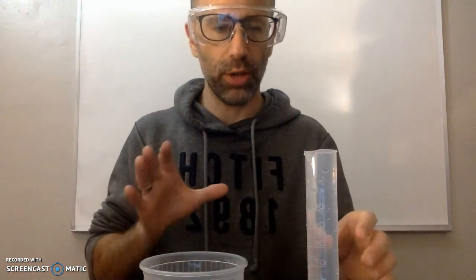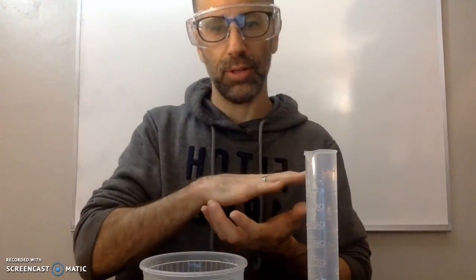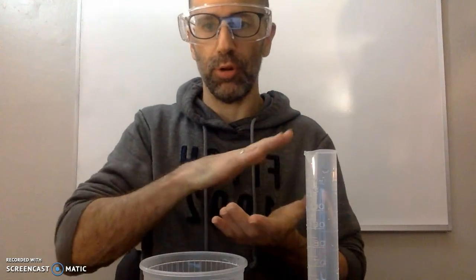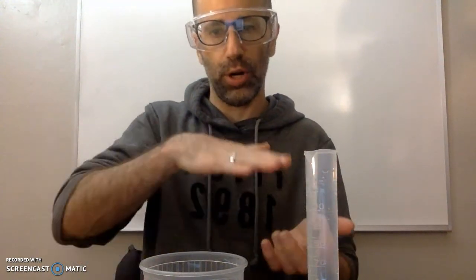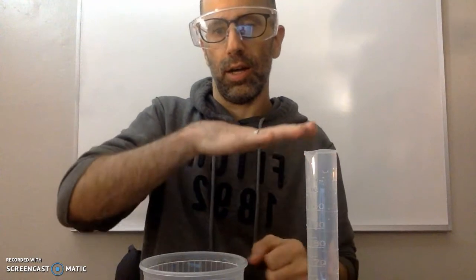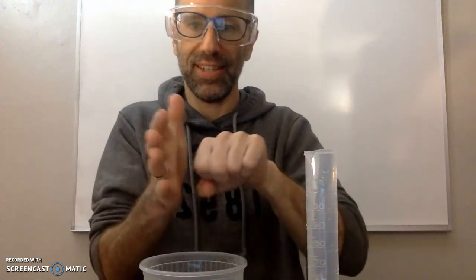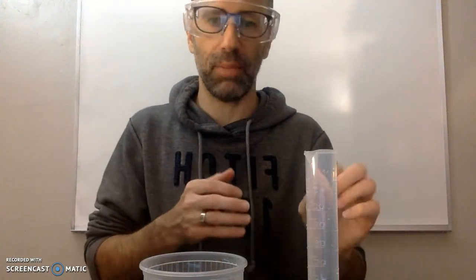If you already have air in there it's going to mess up your results. One way to transfer it: put the palm of your hand tightly on top and squeeze down to create a seal, keeping the water from coming out. Then turn it over with your hand and stick your hand into the water without letting go of the graduated cylinder, otherwise air will get in and you'll have to do it over.